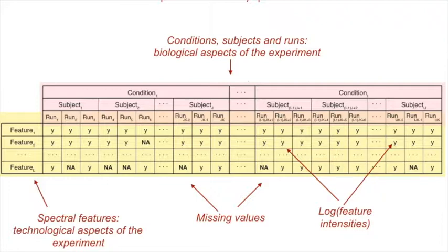So this is one protein, and this is the very general representation that MSstats has in mind. It's a table, and this is what you would get out of the data processing tools. The columns here are different runs. The runs are grouped by condition, and the convention in MSstats is that condition is the combination of all the factors that you may have. So for example, in the cancer cell line study, one condition will be 6 hours, low oxygen, low invasive cell line. The next condition will be 24 hours, low invasive, low oxygen, right? Essentially one condition will be the combination of all the stresses which were applied to the cell line.